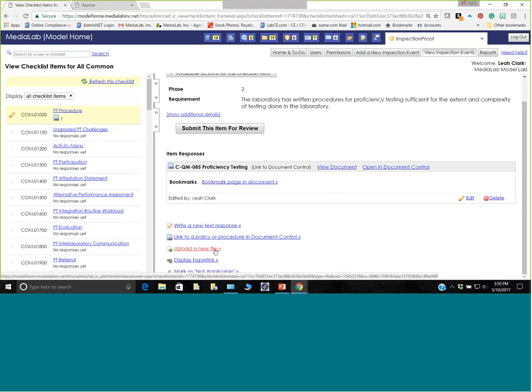item. You can also display a hyperlink. Sometimes you can use this for things like linking to the CDC's notifiable disease page or your state's regulations on how long you hold on to specimens or paraffin blocks. So that can come in handy.